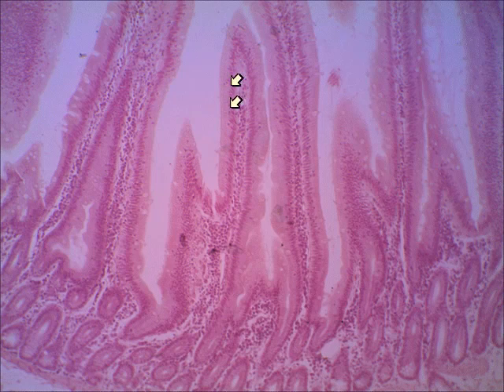Okay. I want you to notice on the surface of each villus, notice the cells that are there. When we put this on a higher power, oh, look right here. Look at that. That should be pretty obvious. That's simple columnar epithelium. The little holes that you see, you might remember from A&P1. Remember goblet cells? I'm going to put the arrow onto the openings within goblet cells.